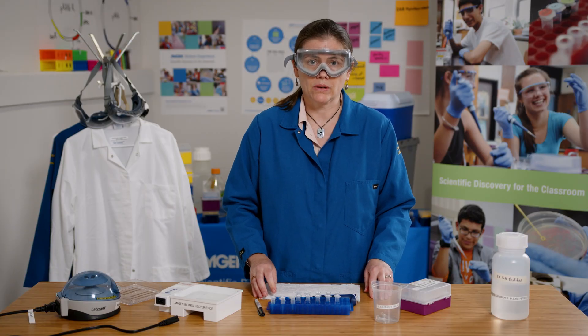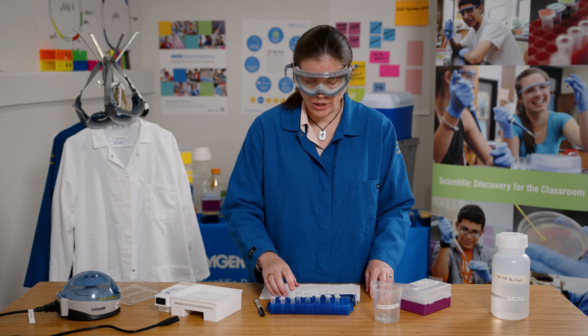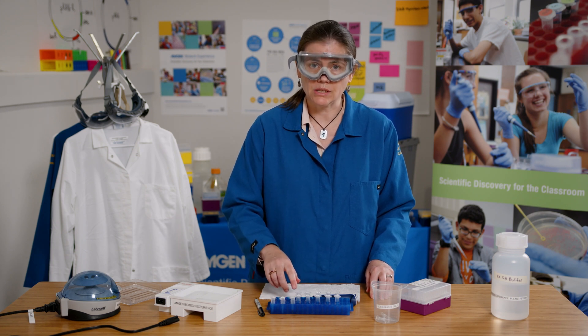Next, I'll add four microliters of each of our digest samples and five microliters of the lig tube to their corresponding GE tubes.